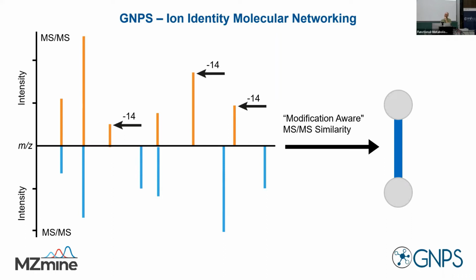The raw data files need to stay in the location where they are, and then the project will reference them. But that's for your local file system. If you want to share the project with someone, then we have the complete option, where we pull everything in, and it's self-contained. So you can send it to someone. It's humongous, but you can share it.